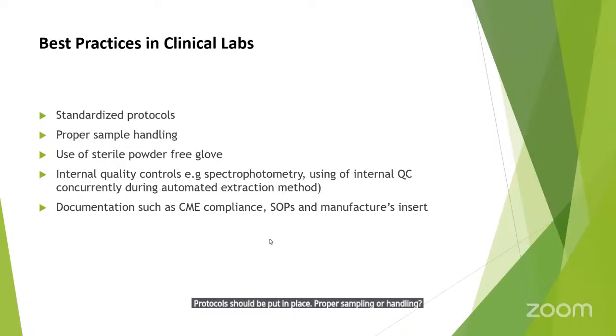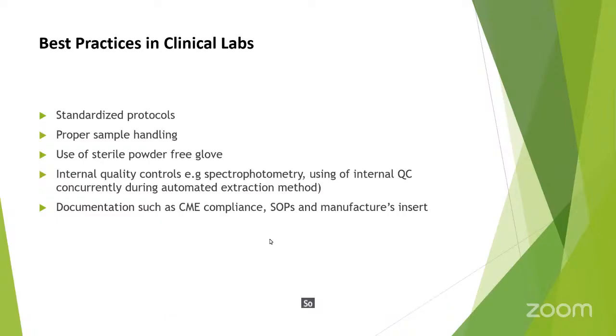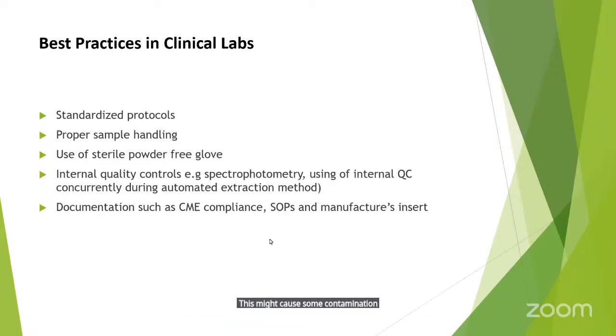When I say proper handling of samples, you know very well the phases: the pre-analytical phase, the analytical phase, and also the post-analytical phase, so I will not talk much about that. There is also the use of sterile powder-free gloves, as I mentioned, because powdered gloves might cause contamination and interfere with the amplification.